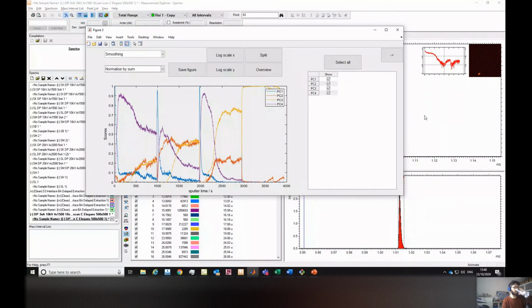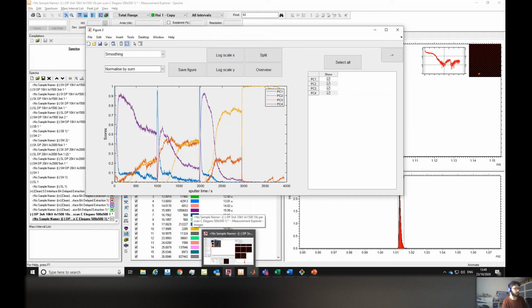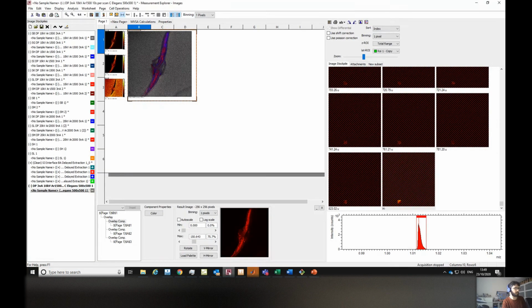Any other questions? Hi, Gus. Hey, Gus. Could you briefly go over how you do these etching TOF images? The experiment, is it as in how do you do it on the Surface Labs, when you're acquiring the data? You mean a 3D data set? Yeah. How do you get a 3D image data set?